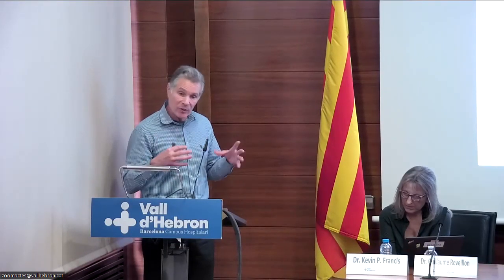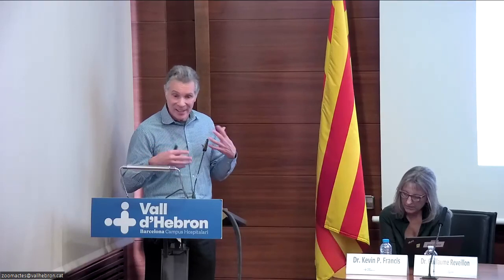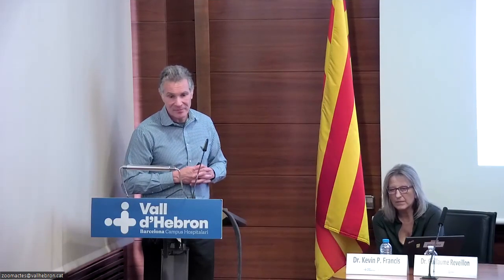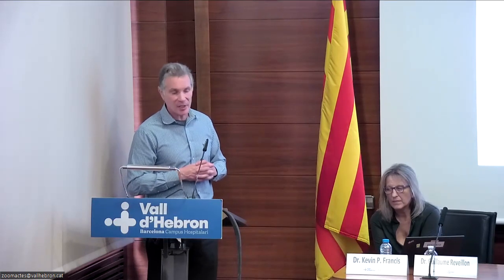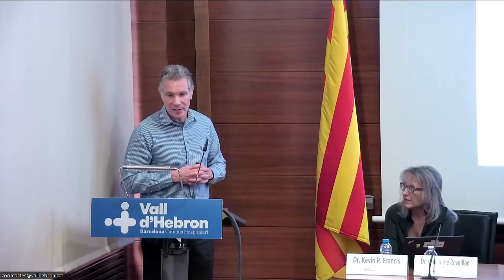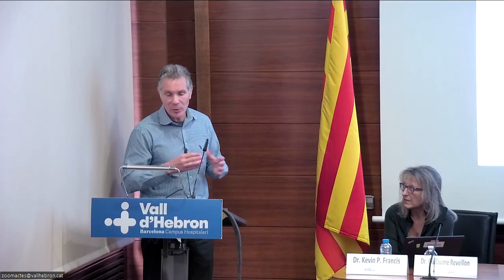But when you want to do real live imaging, you need a kinetic camera, and that would be an ICCD or an EMCCD camera. It was not an experimental equipment. It was not a Spectrum CT. No, it wasn't doing that. It was using a separate setup in the paper, because they wanted to do real-time imaging.